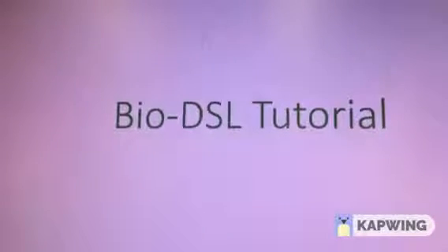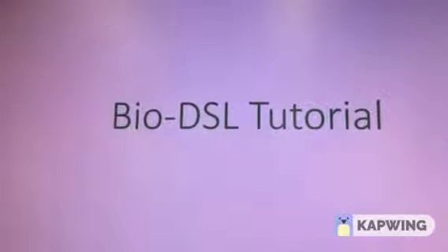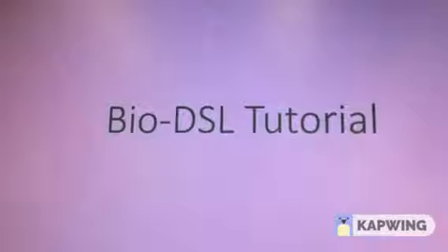Welcome to the Bio-DSL tutorial. Bio-DSL is a domain-specific language for bioinformatics domain. It has a simple syntax and a minimum set of keywords. Biologists can write a workflow using the visual elements offered in the Bio-DSL interface.